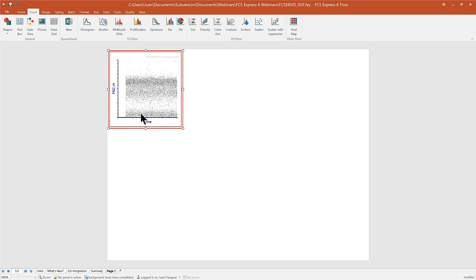But with this plot, if I wanted to show some parameters that make sense to me or that will help me start gating my cells of interest, I can simply just click on the X or Y axis, and then I'll see something more recognizable. Okay.